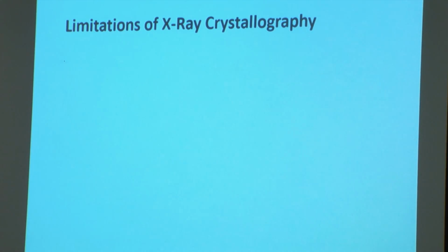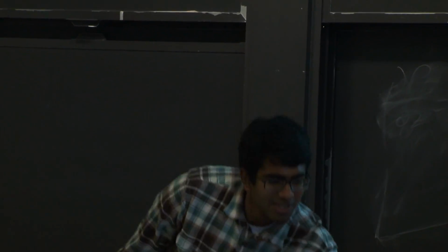And so the next part of this recitation would be thinking about some of the limitations of X-ray crystallography. There are a lot of them, but I'll turn to all of you for input. Yes? Is it difficult to develop crystals of certain types of proteins? Yes, absolutely.